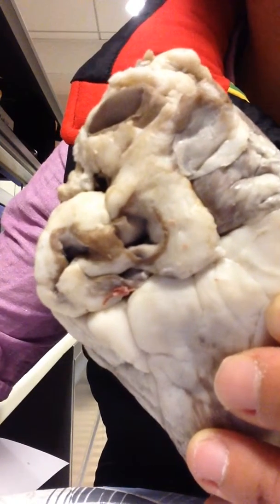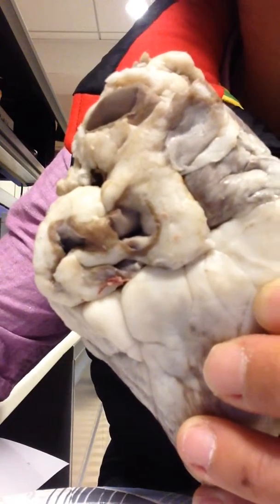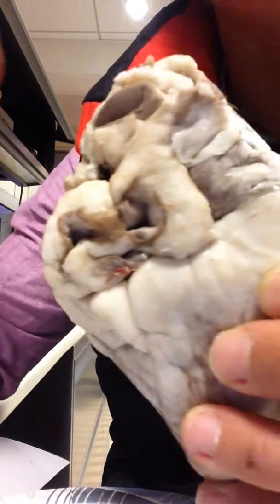And then the next question is, are these vessels veins or arteries? They are veins that form a large vessel. Next question is, is the blood they are carrying oxygenated or deoxygenated? The blood they're carrying is deoxygenated.